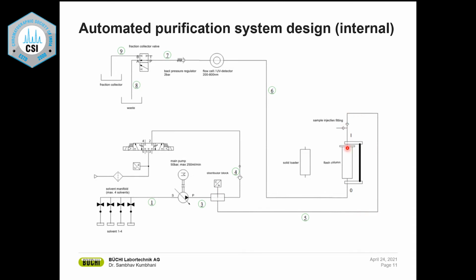It enters your cartridge or column over here, and this port over here is your injection valve. Over here, you inject your sample. As you inject your sample, your mobile phase takes the sample with it and comes inside the column. Your separation occurs in the column, and then one or multiple individually eluted compounds will follow along, come to the UV detector, and you will see your detection response in terms of a chromatogram on your screen.